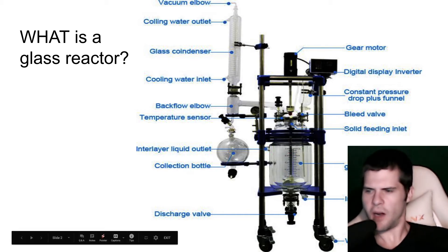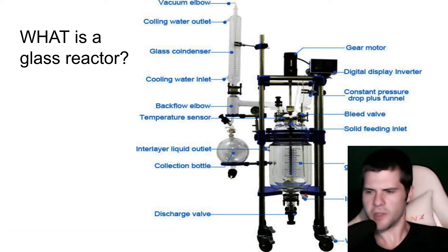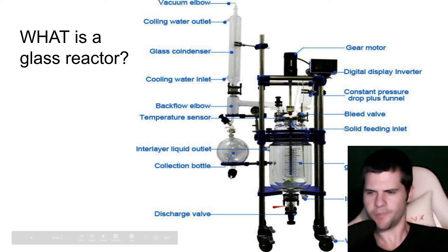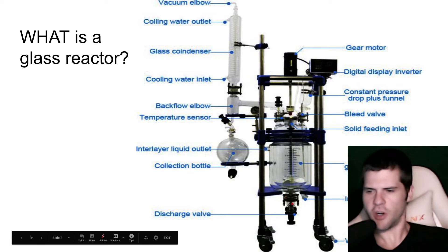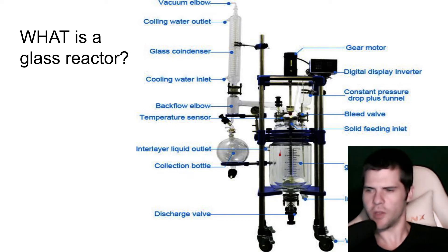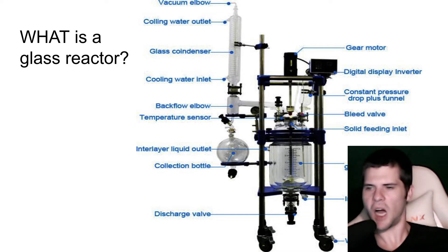Here we have our interlayer liquid inlet, which is what we are going to circulate heating or chilling fluid through in this jacket surrounding it. Here we have some wheel brakes to keep this unit from moving around. Right here you'll see the discharge valve, which will allow us to recover whatever happened inside of our reactionary vessel.